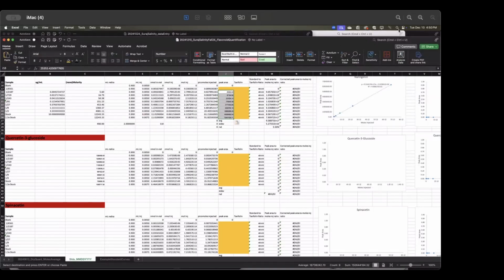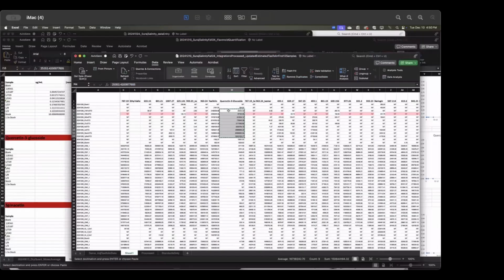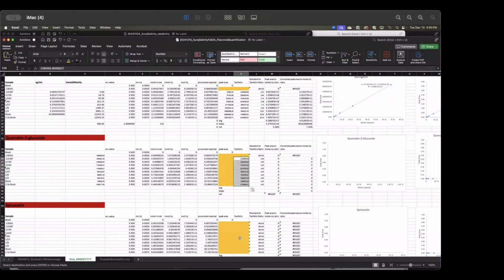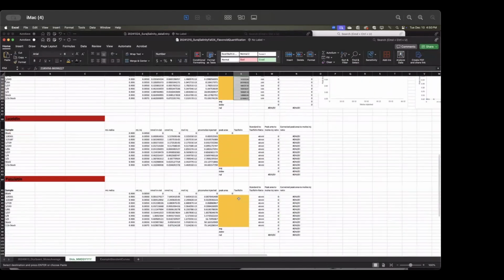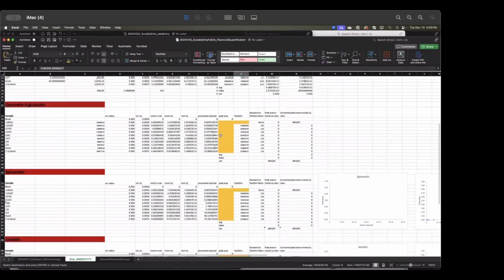Okay, and then we'll go back to get the taxifolin values. What's nice is once we get the taxifolin values, we can just paste those in for each one of them, because again, it's the same thing for each one. Normally we have a 6561 full diluted stock, but we didn't include that in this particular run, so that's why that one value is missing there.